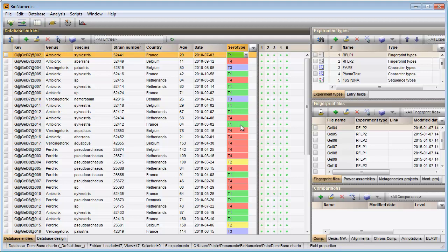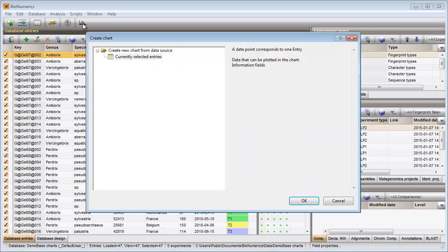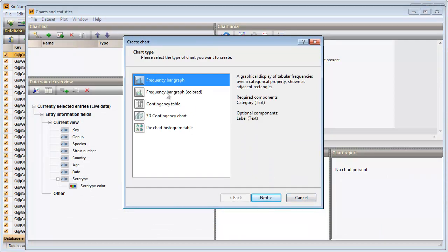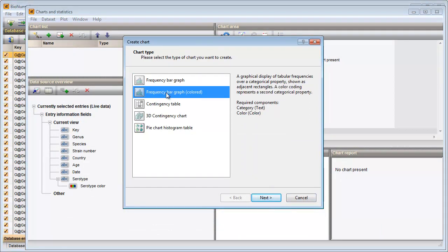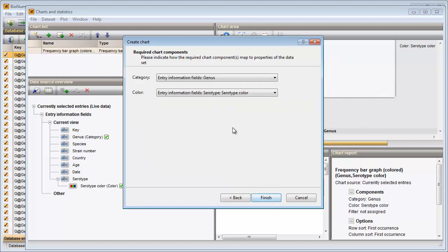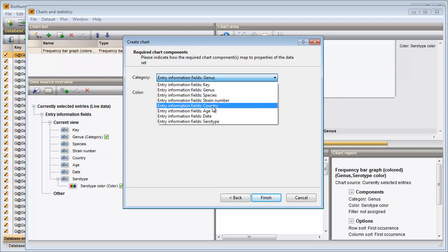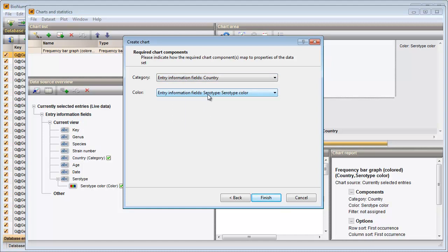I select all entries in my database using the Ctrl-A shortcut on my keyboard. I call the Charts wizard by pressing this button in the toolbar and choose 'Frequency bar graph colored' as my chart type. I select country as my category and the serotype states as my coloring. Pressing the Finish button will plot the data in the Charts window.